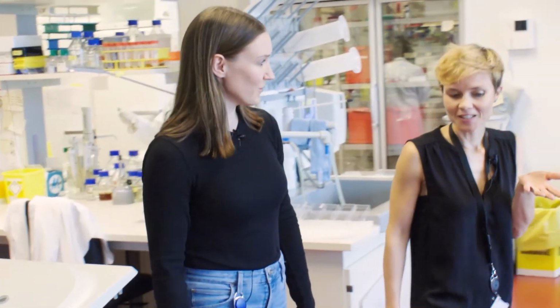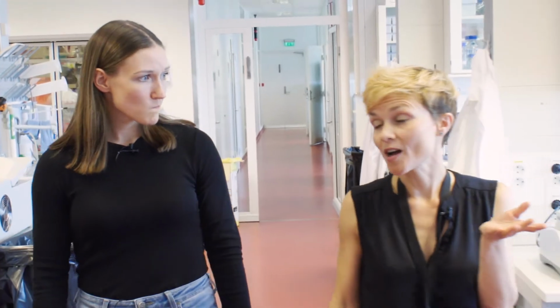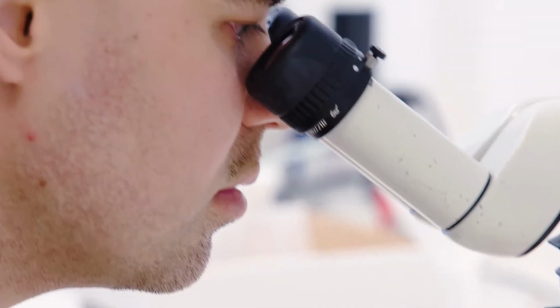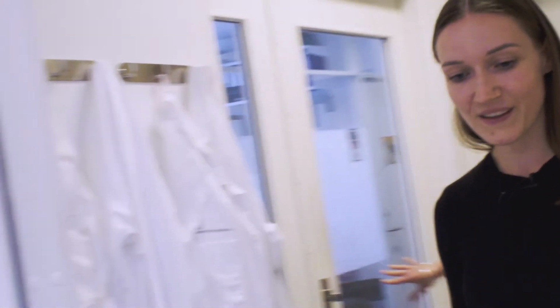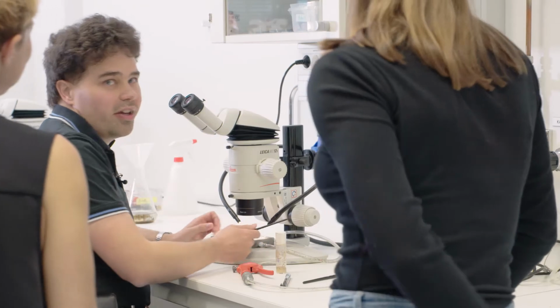What are we going to do now? So I thought we'd go and see if Sabi is in the fly room. He's worked with Drosophila for a while, and he's going to tell us about the different applications. Okay, so that's the fly room. That's right.